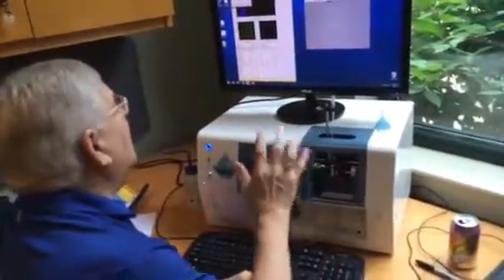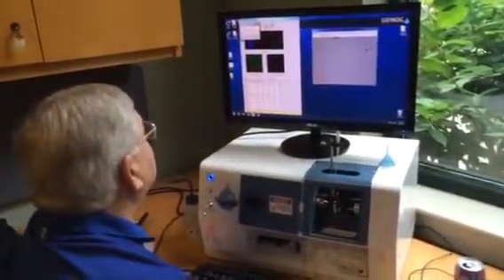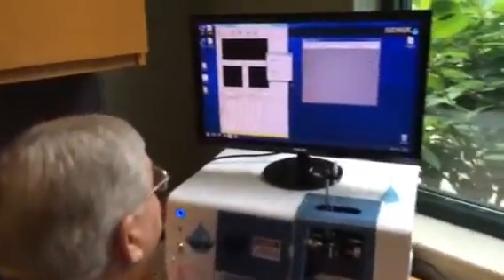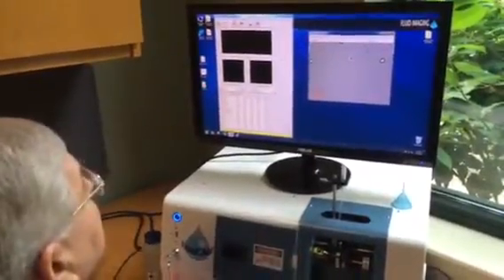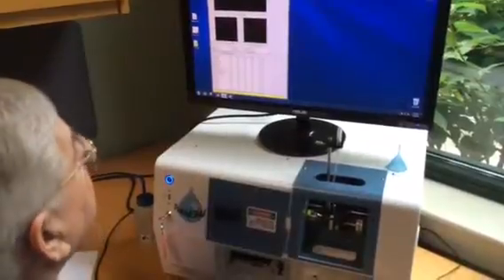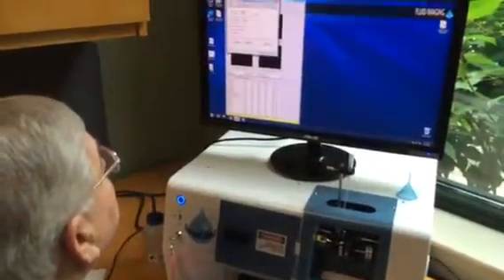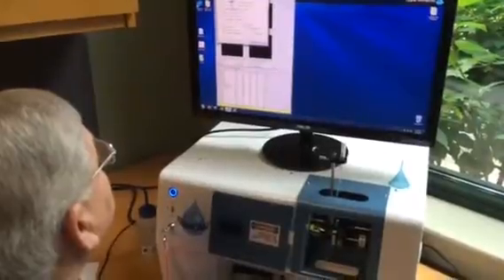Right now, we're sitting at the final focus. So we can move out of the autofocus routine now. You just say okay, it doesn't do anything. And we can close the setup and focus window, this one right here. Okay. And let's go to context, and let's go to fluidics. Let's just do a 2 mil sample instead of 1.